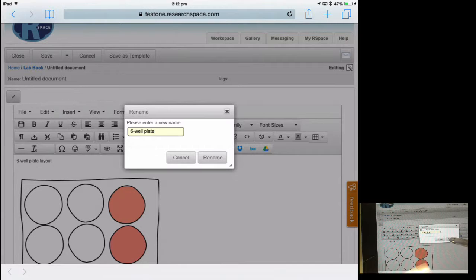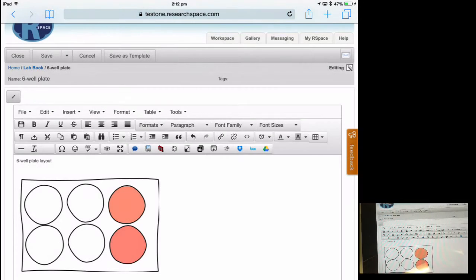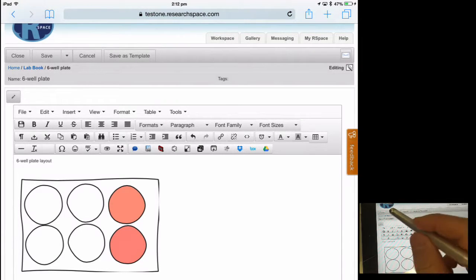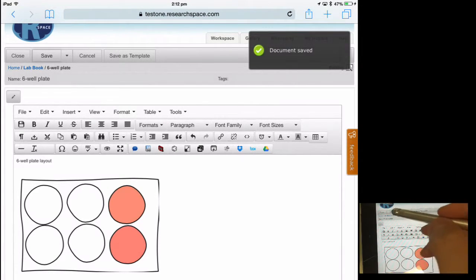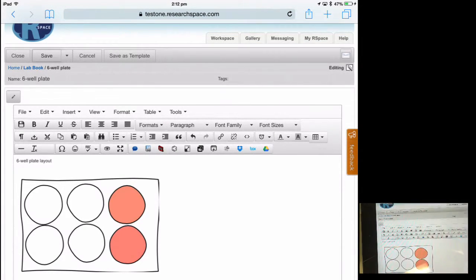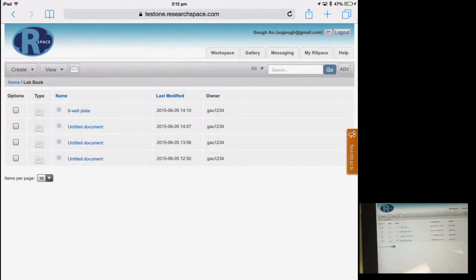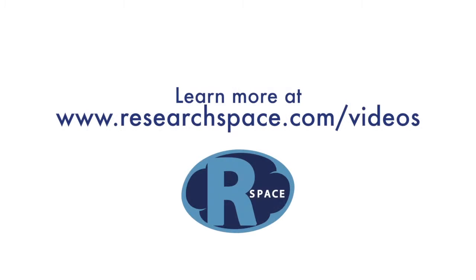Once you've clicked save and close, the document will be available through RSpace no matter what device you log in from.